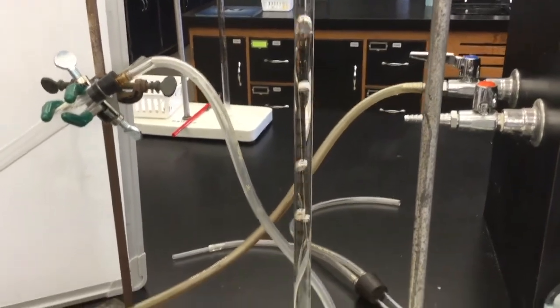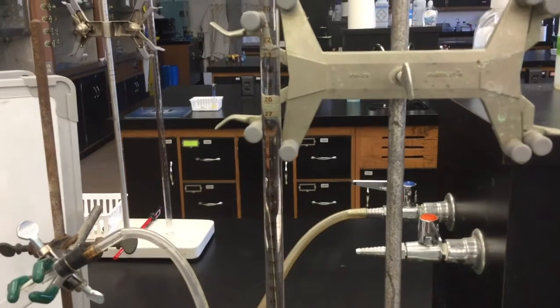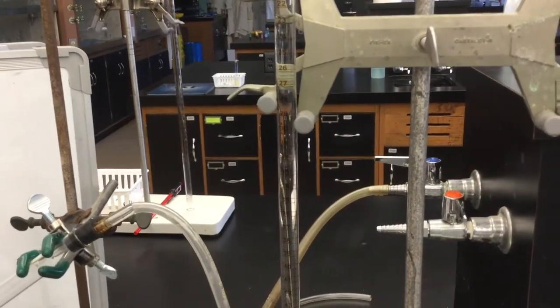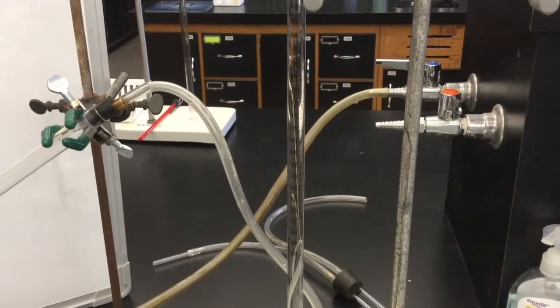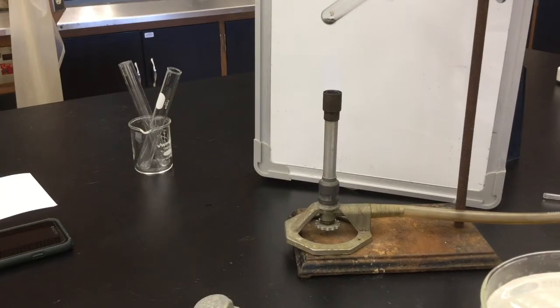You will initially get some bubbles from the heated gas that is displacing, but most of the gas that is moving over is coming from the reacting of the material. So as the reaction comes to completion, the amount of bubble formation will be slower and slower. After about a minute, you are going to move to a higher temperature setting to ensure that all of your material has reacted.